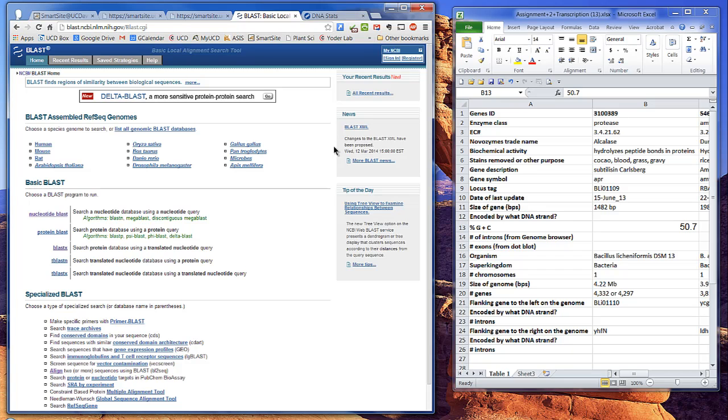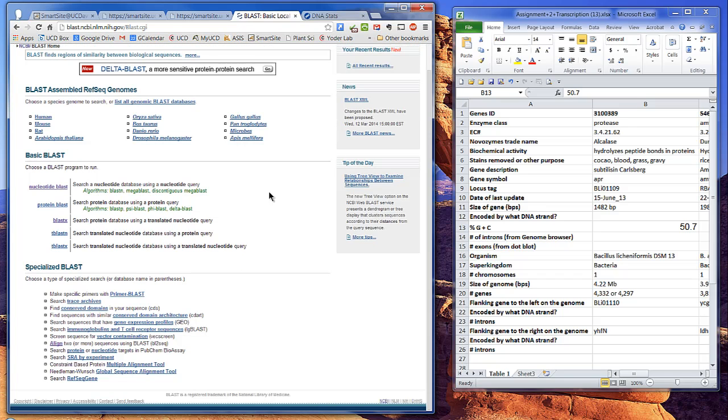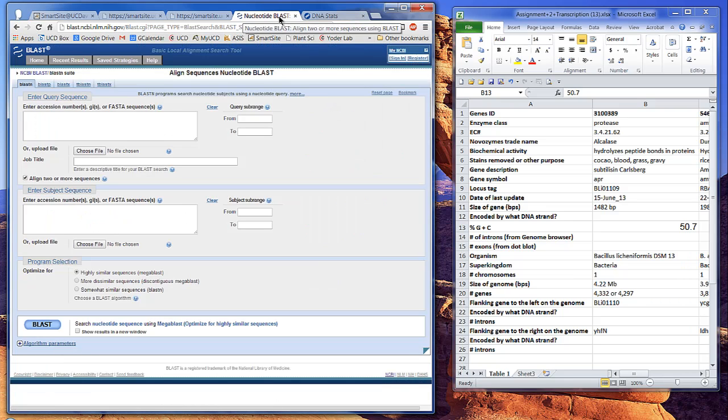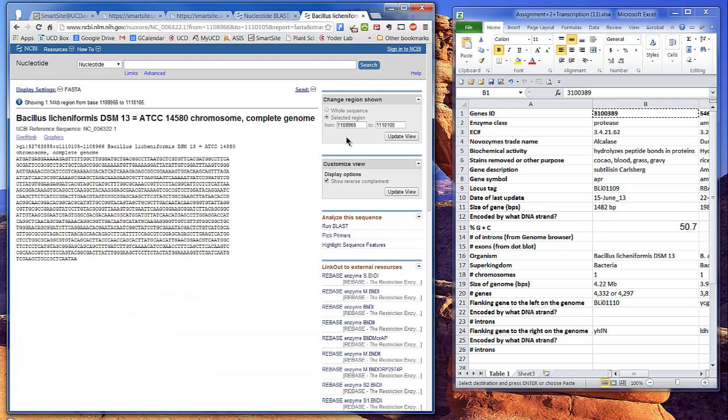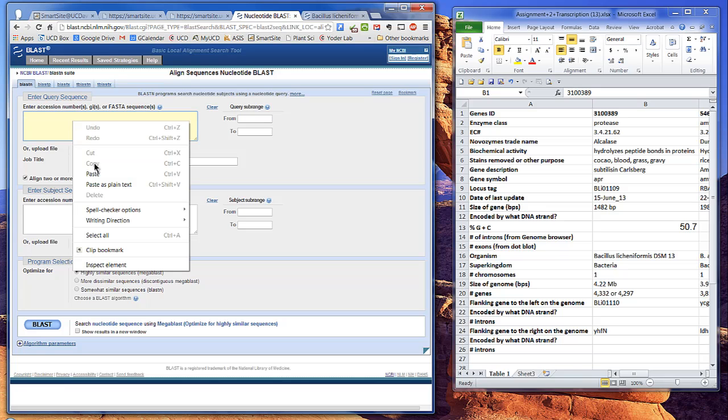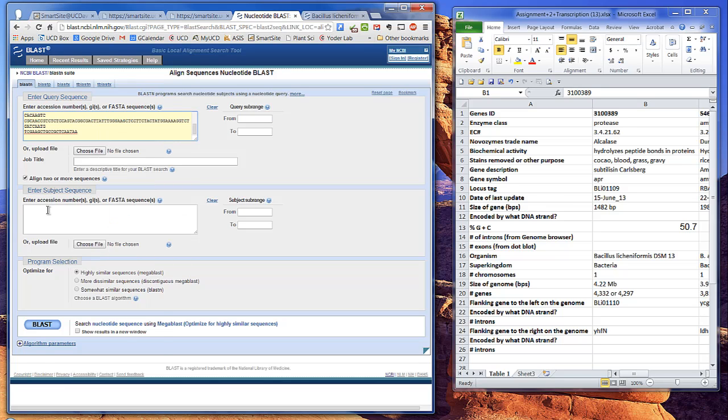There's many flavors of BLAST, and we're going to use a specialized version of BLAST-N, and this is called align-to sequence using BLAST. For input, you give the program two FASTA-formatted sequences. In this case, let's use the APR gene, and we'll put the same sequence in both boxes.